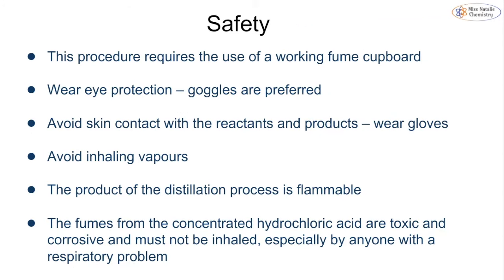So in terms of safety, there are again quite a few safety rules here. So we need to do this in a working fume cupboard. The reason for that is it does give off vapours that are particularly toxic, and we don't want them to be inhaled by anyone, especially not if you have a respiratory problem. As normal, we want to make sure we have eye protection, and we want to avoid any skin contact with our reactants or products. And lastly, this is a flammable liquid, so we want to make sure that there are no open flames.